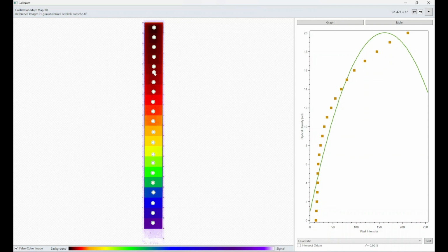But as you can see, as I'm manually adjusting these steps, this is the data. So these yellow squares here relate to the samples that are taken from all of these sampling points at every point. And this green line here is the line of best fit. It's basically the standard curve of what those pixel intensities are going to be when represented as optical density.